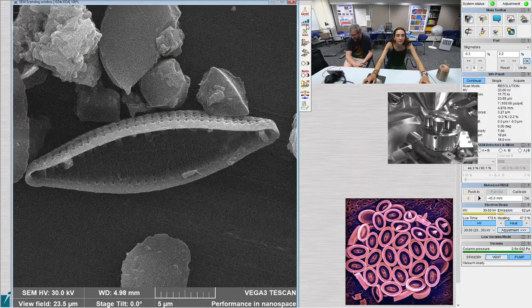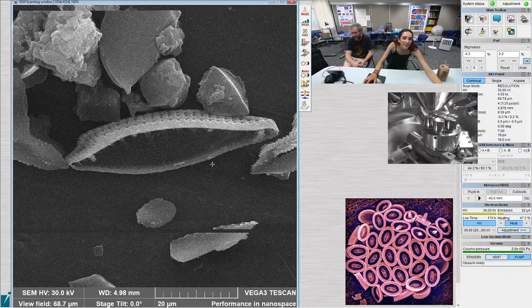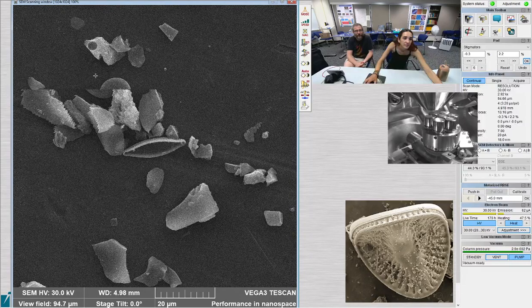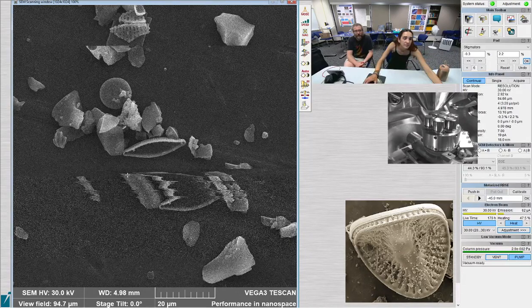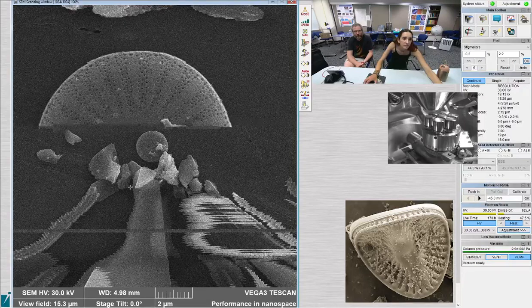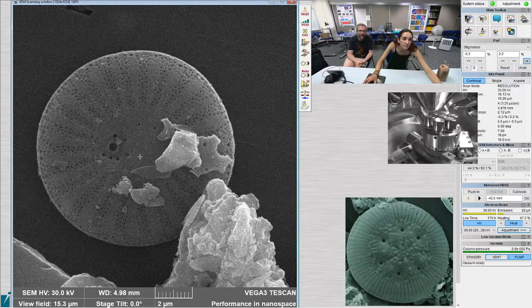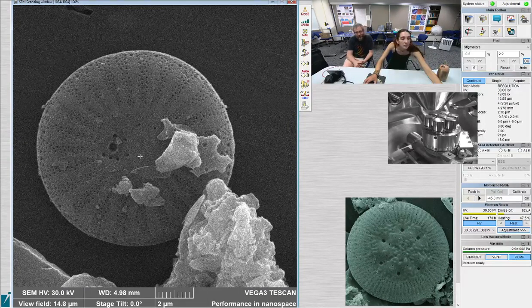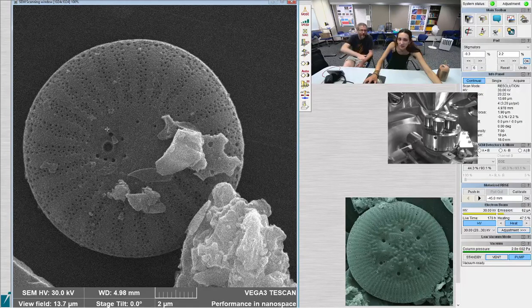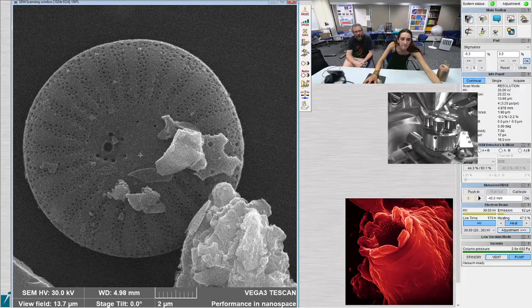Yeah. Let's see. It looks like it's split in half. It's because it is. All diatoms where you can see the inside, or the inside and the outside, are split in half. This one. Yeah, that's the same diatom, just a small version of it. Do we want a picture? Sure. Okay. This part is really particular, yeah, no? It's the depressed side, the downward side of the tangential undulation.